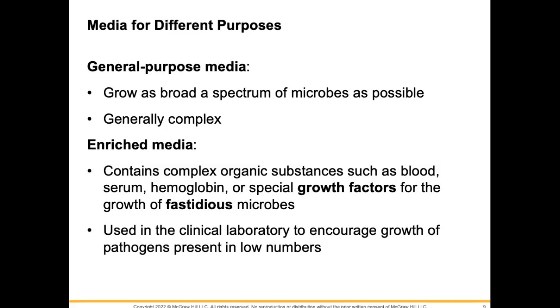The microbes will grow better on these types of media because there are things that they prefer enriched in the media. So we use enriched media in the lab to encourage the growth of pathogens if they're present in low numbers.